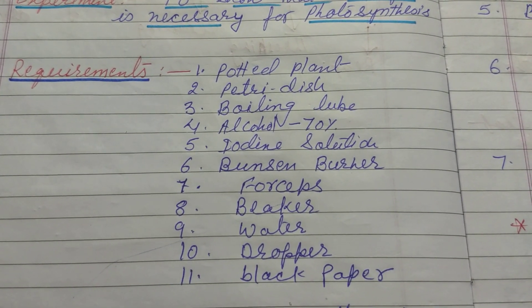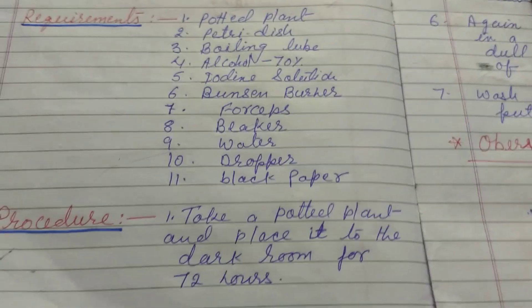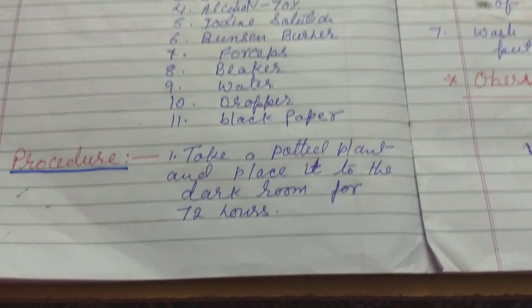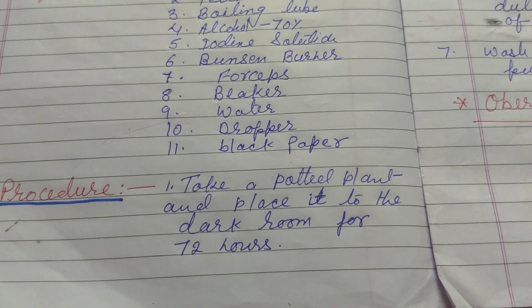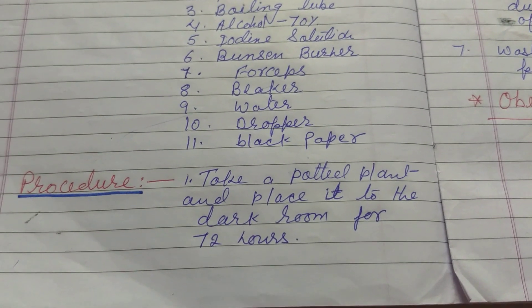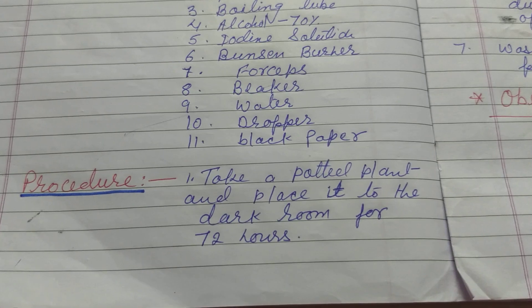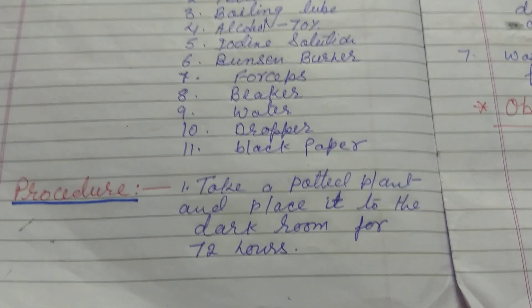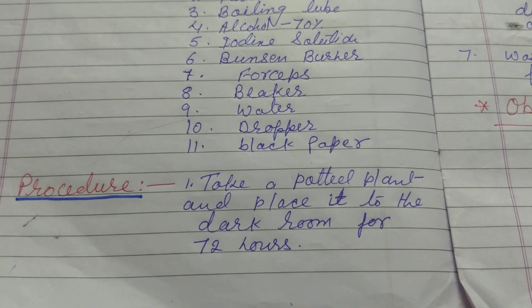Now we are going to learn about the procedure. First, take a potted plant — a pot with a green plant — and place it in a dark room for 72 hours.